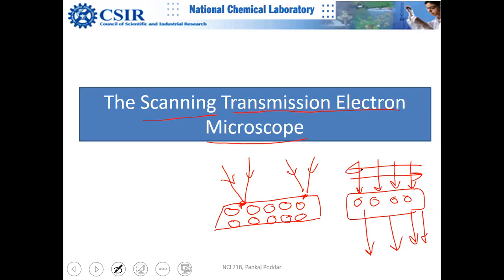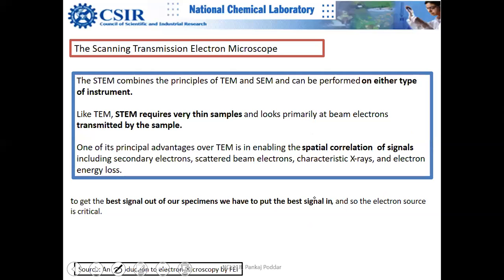But here you are scanning the beam, like you move the laser pointer on a presentation. When you're doing a presentation, you move the laser pointer in different directions. So it's like that. It combines the principles.